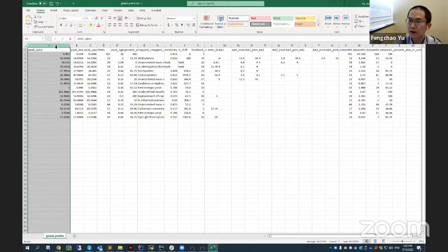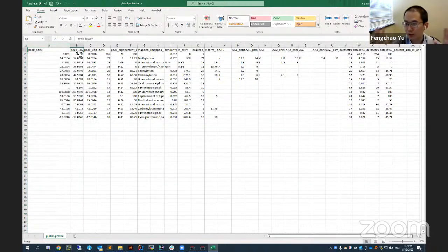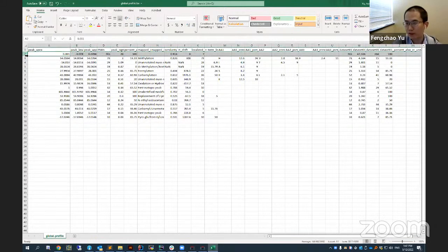They are some kind of unknown modification which you don't know before you perform the search. With this delta mass, you can generate histograms. Those histograms will have apexes. We can do the histogram peak picking and get an apex, a lower boundary of a peak, and an upper boundary of a peak. The most abundant apex is 0, which makes sense because most PSMs don't have any modifications.